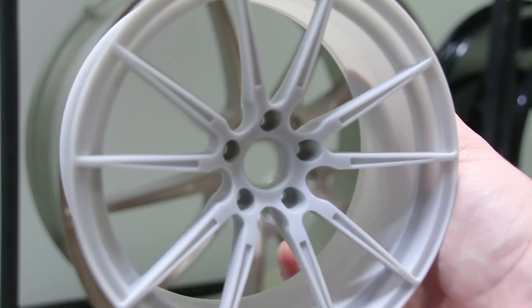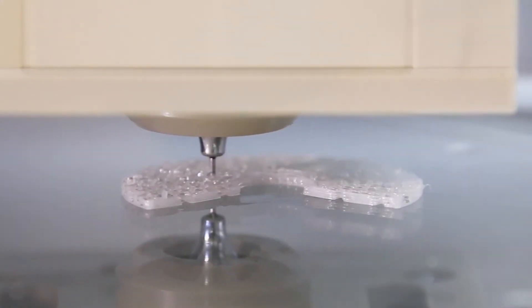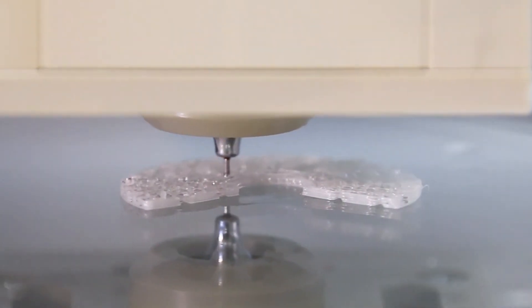Additive manufacturing has been around and it's established for automotive industry and aeronautics. Now we need to bring the biomedical group together with these experts and use 3D bioplotters to make this manufacturing a reality.